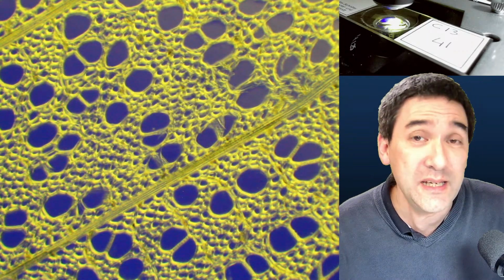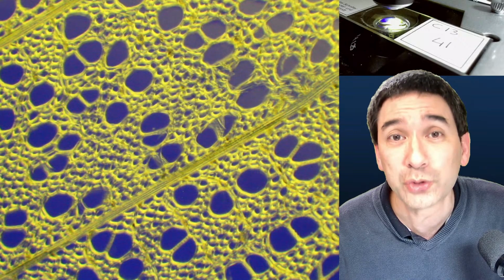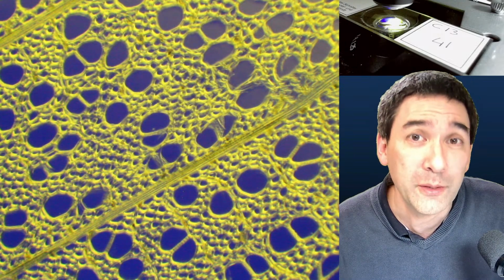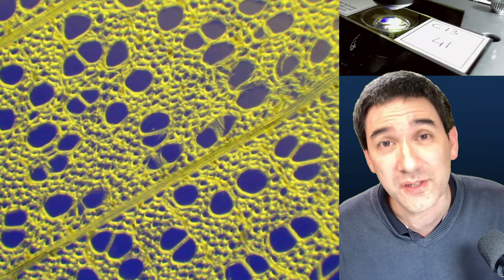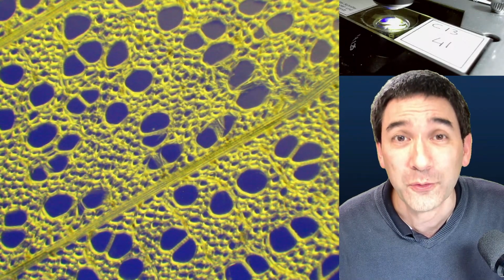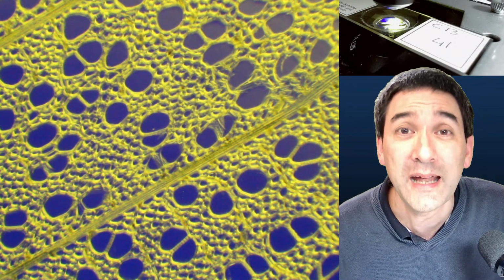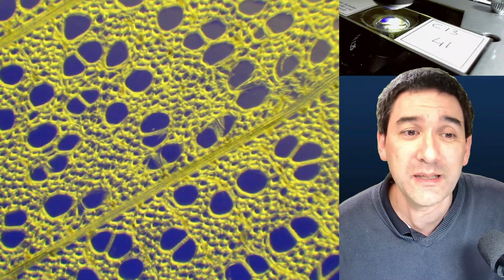Generally, what I would say is that it's to a certain extent probably a question of taste. But I would say that LEDs probably are the more modern system. However, I have found, especially with some cheaper microscope manufacturers, it might become difficult to actually find replacement LEDs, while there are still low-cost replacement halogen bulbs available.